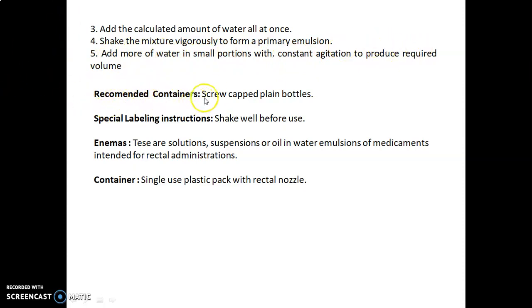Then recommended containers: screw capped plain bottles. Special labeling instructions are shake well before use, as it is a liquid dosage form.